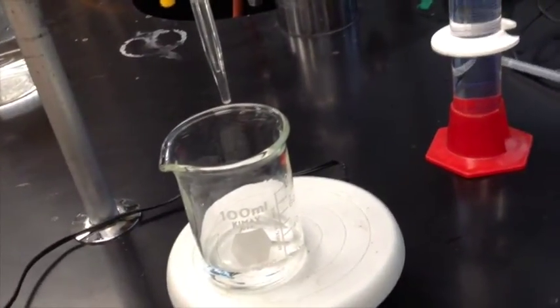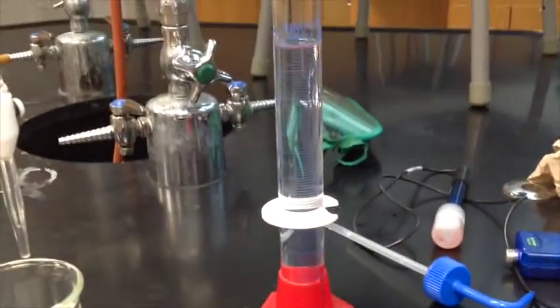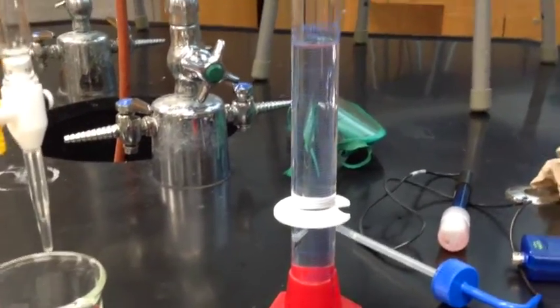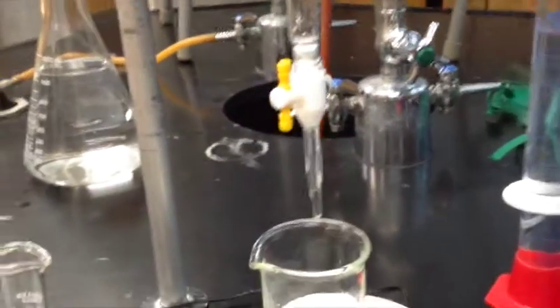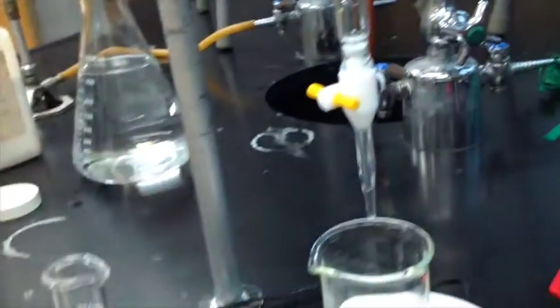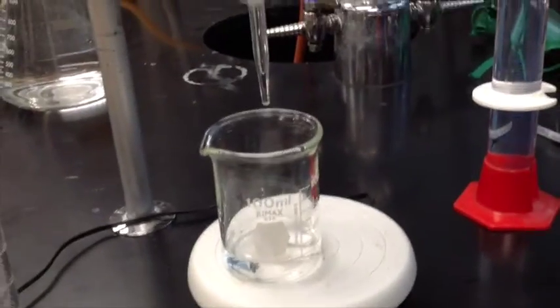everything into there. And I'm going to fill up my burette with some base. Now I've carefully prepared exactly 0.100 molar sodium hydroxide. And I just need to add that to my burette. Now it's important to do something when I add it to a burette. I need to make sure the stopcock is closed. If it's not exactly closed, I'm just going to be pouring base into here and not be quantitative. So I'm going to use the funnel here, and I'm going to pour it in while lifting the funnel out of the burette a little bit so air can escape as the liquid comes in. So I'll do that now.